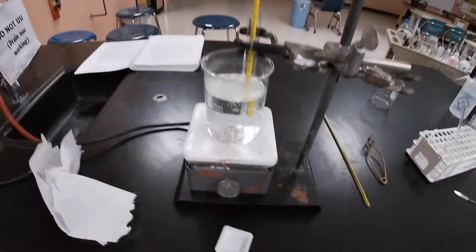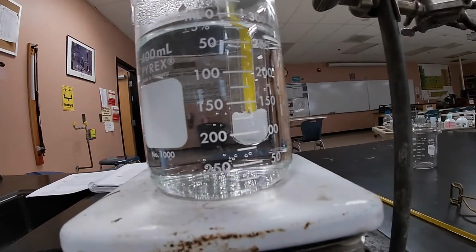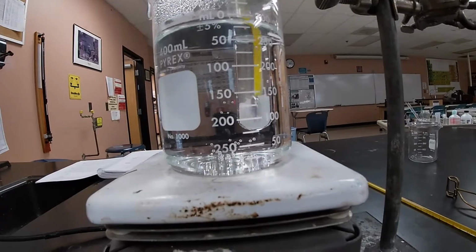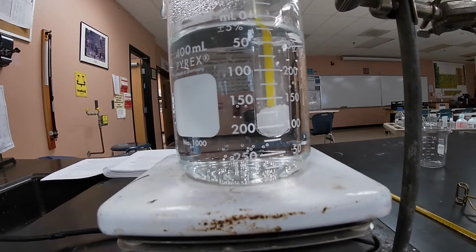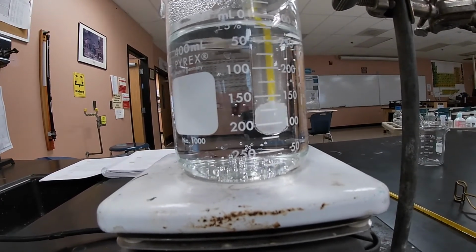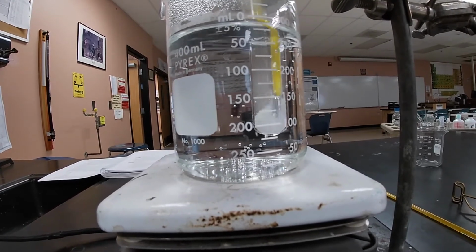We'll go ahead and do the same thing, and hopefully as you can see, we're doing the same process. We're almost done dissolving. Hopefully you can see some of it, as we increase the heat, is going into solution. And so I'll continue mixing the 4-gram one, and then we'll do the same process.